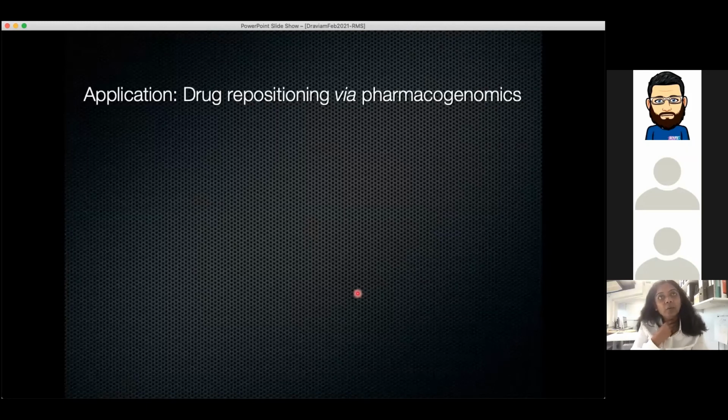So where do we think these kind of tools can be applied? So the use of these kind of tools is where we need high throughput imaging, but also high speed imaging. So I'm going to spend like a couple of minutes telling you about a pharmacogenomics project in the lab where we really could see the benefit of this kind of technology.